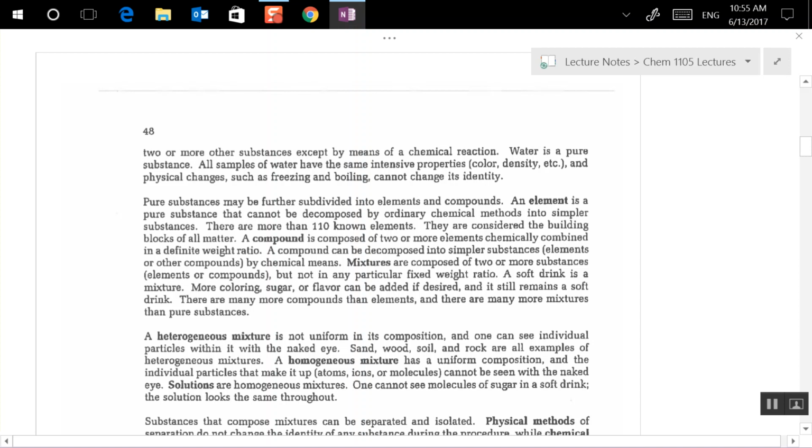Okay. Then, if you turn over to part B, you'll notice that you have 4 different substances: white sand, powdered carbon, powdered magnesium, and sodium chloride.